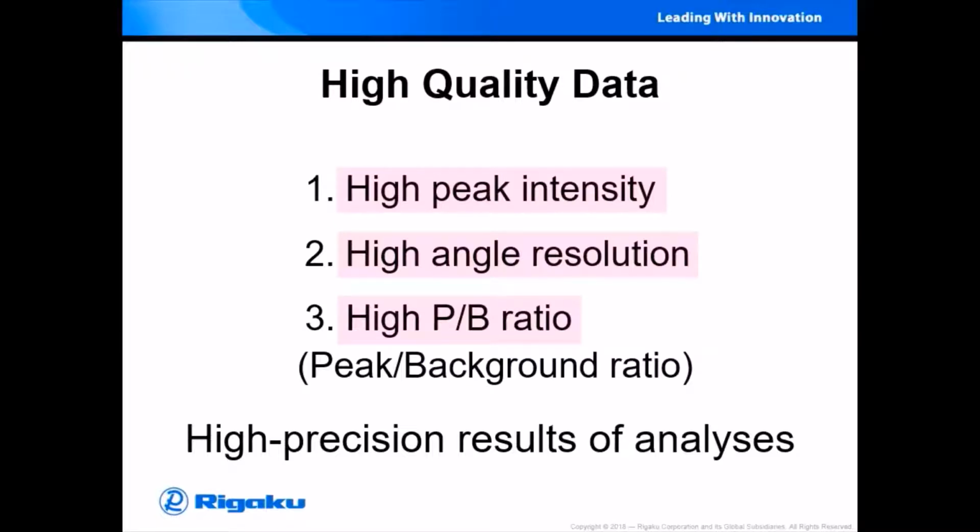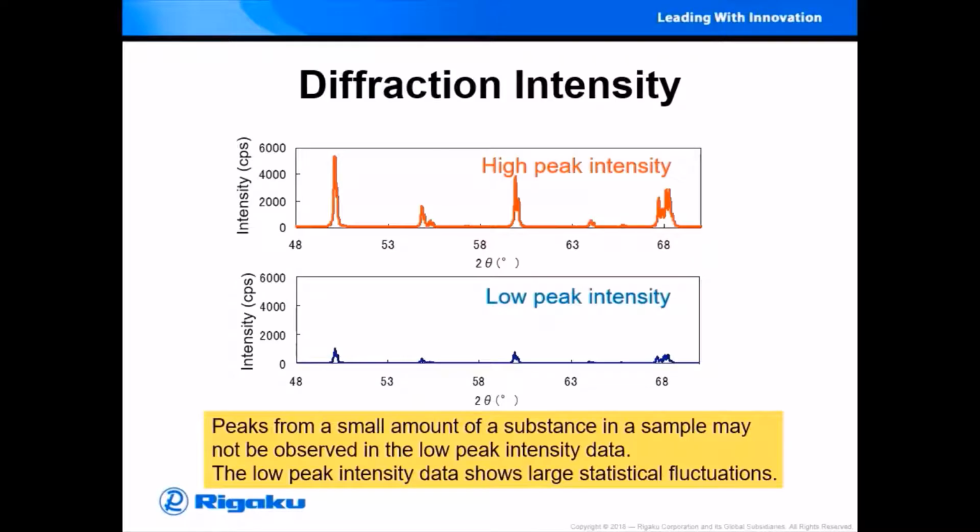First, I'll show the high peak intensity data from among the 3 factors. The high peak intensity data give the accurate peak angle, intensity, and width.